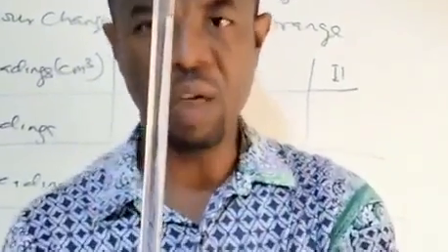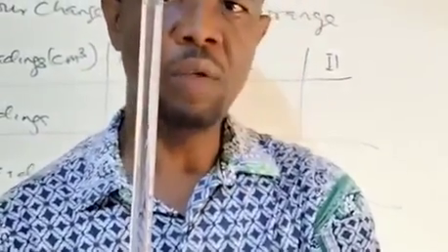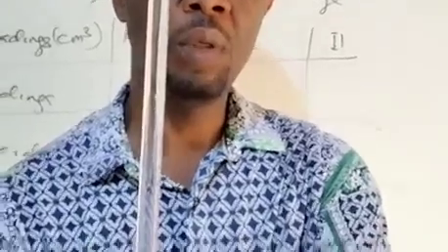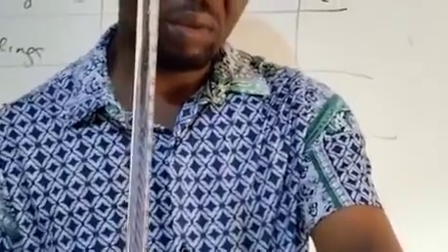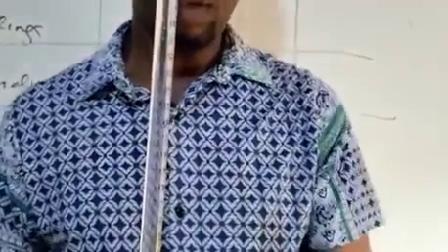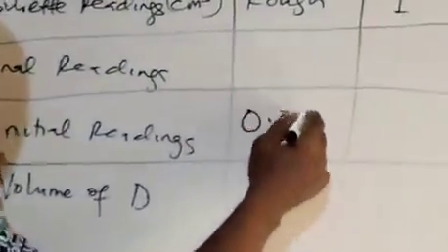So I can adjust it by opening the tap, drop by drop. So yeah, it is at 0 now. So you can see that intact. So that's 0 now. So we'll now report our work. Here we'll now write initial volume under rough as 0.00.